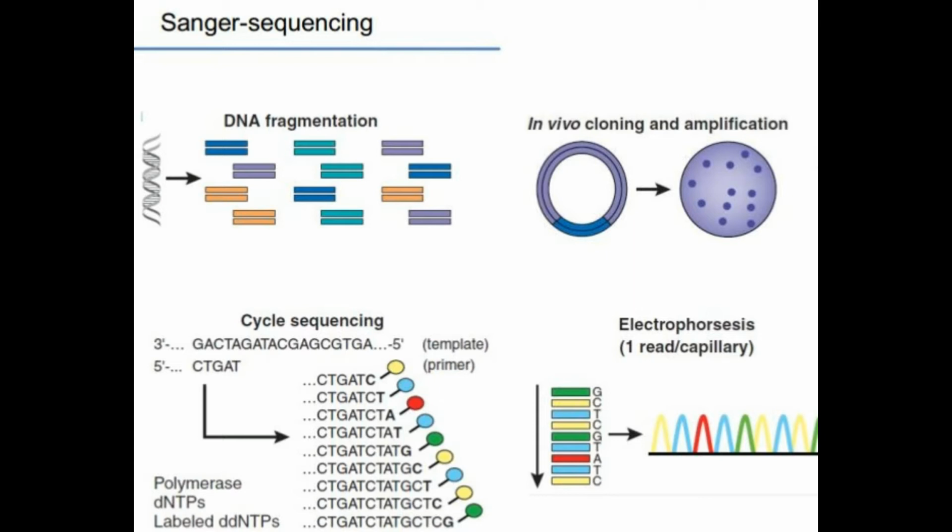fragments to a dNTP and ddNTP mixture. Over here, dNTP is a normal ATGC molecule, and it is going to be simply polymerized along the DNA fragments. The ddNTP nucleotide contains a fluorophore and it is going to stop the elongation process because it lacks an OH at the 3' position. So this way we have a chance incorporation of ddNTP in any location.